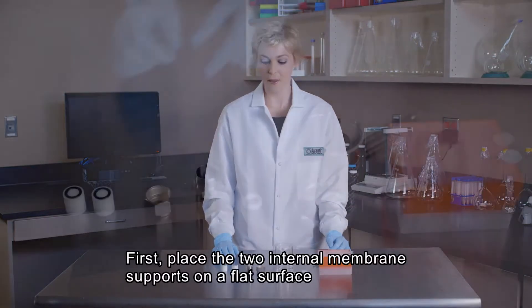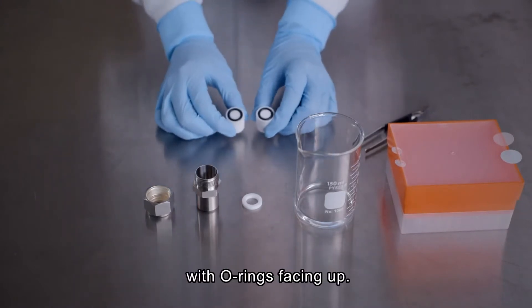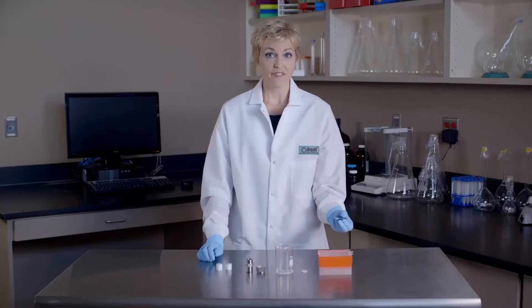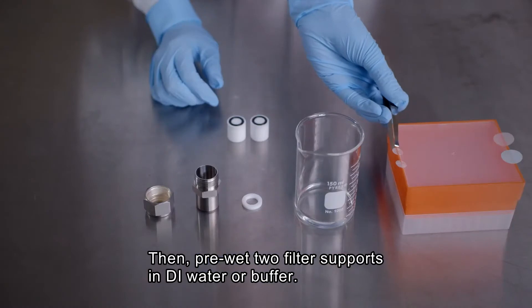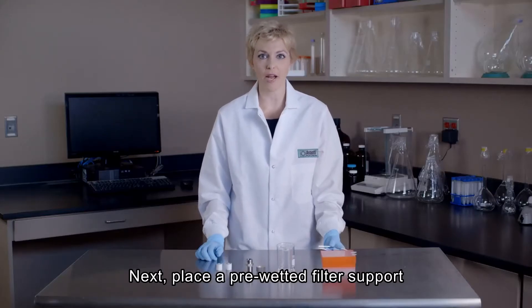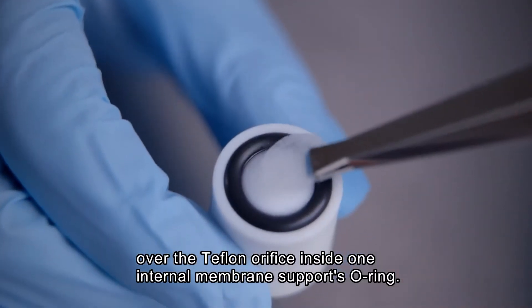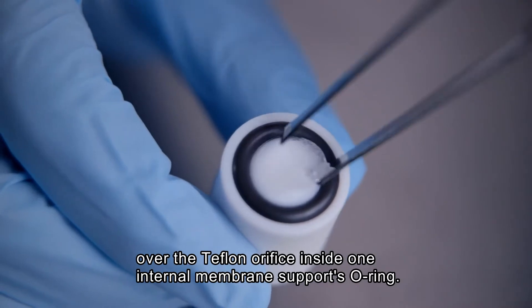To assemble the mini extruder, place the two internal membrane supports on a flat surface with the O-rings pointing upward. Then pre-wet two filter supports in deionized water or buffer. Next, place one of the pre-wetted filter supports over the Teflon orifice on the inner diameter of the O-ring of one of the internal membrane supports.